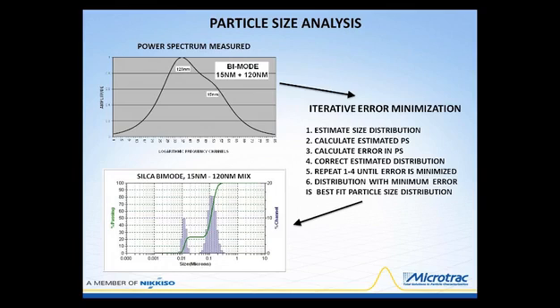So with this bimode here, the contribution of the 15 nanometer particle is shown as a distortion of the 120 nanometer spectrum, and that addition then is what gives us the ability to calculate a mode at 15 nanometers and a mode at 120. The process is relatively simple.